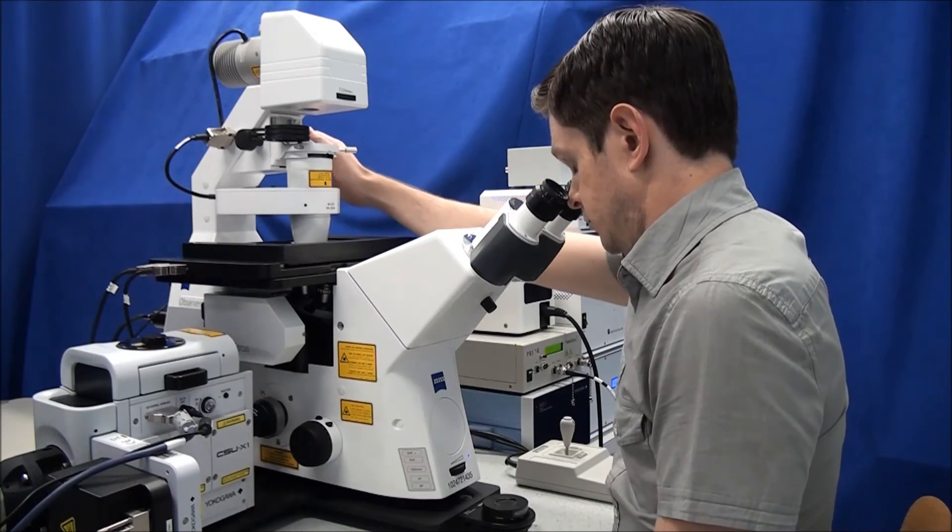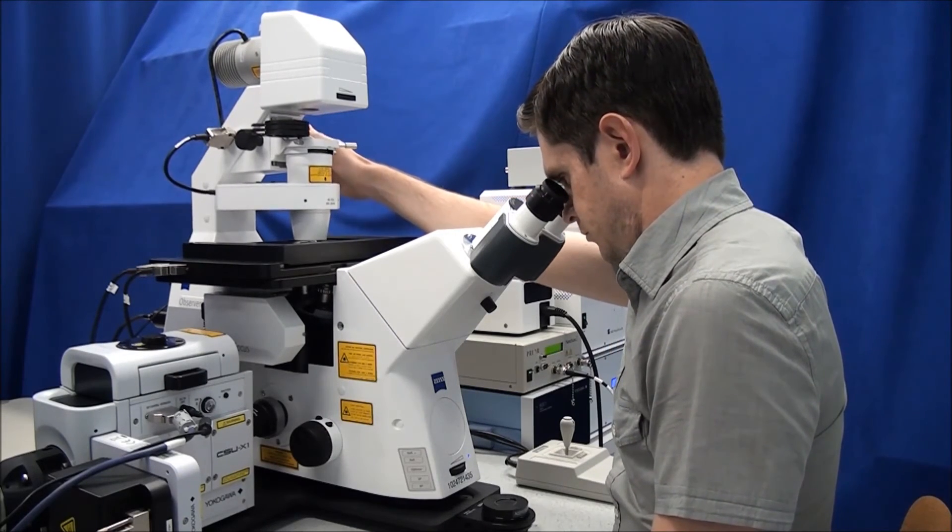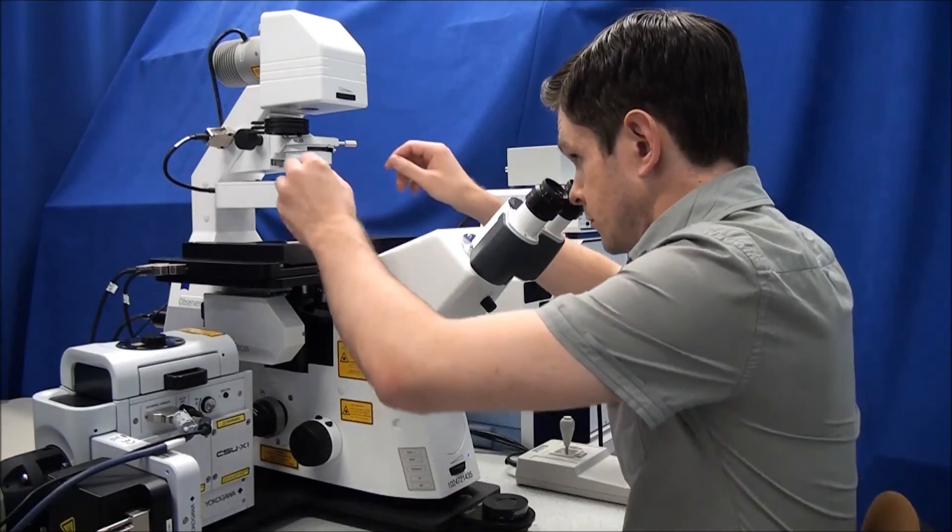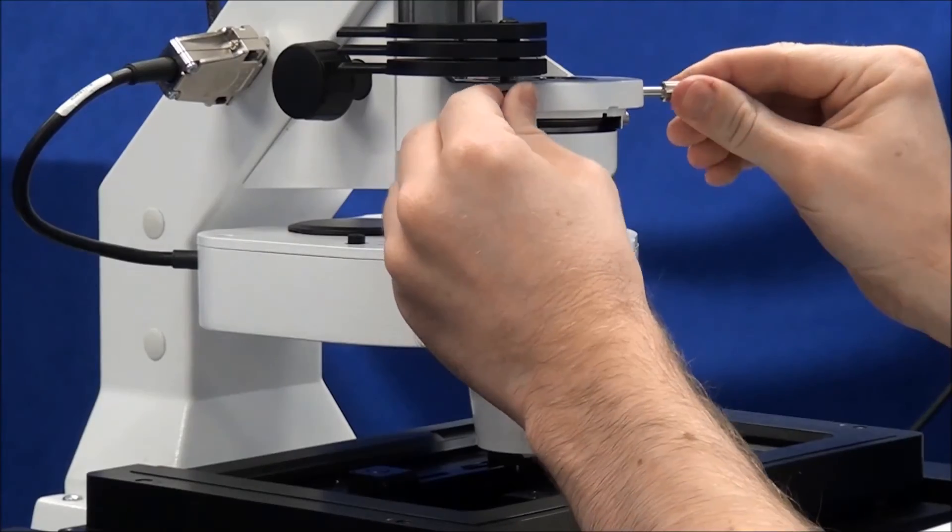Raise the condenser by rotating the condenser focus knobs until the field diaphragm blades come into focus. Center the field diaphragm using the silver centering screws over the condenser.